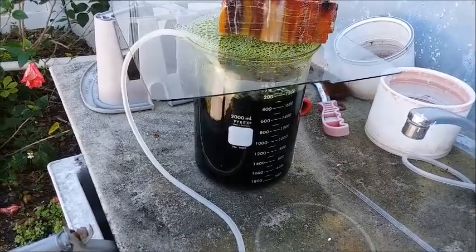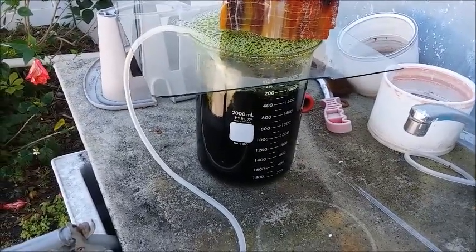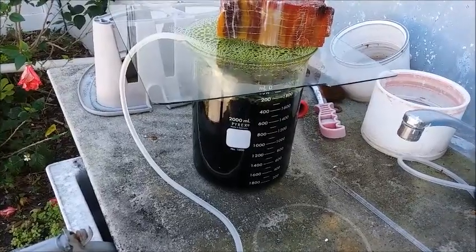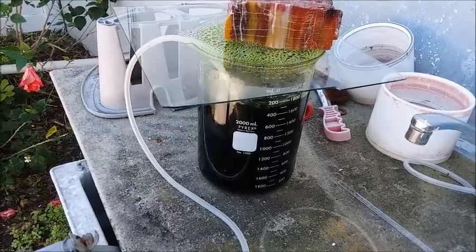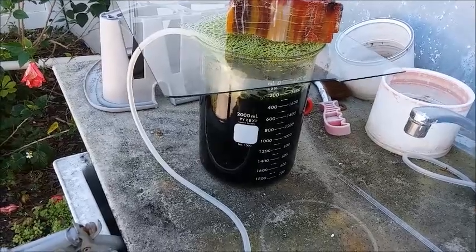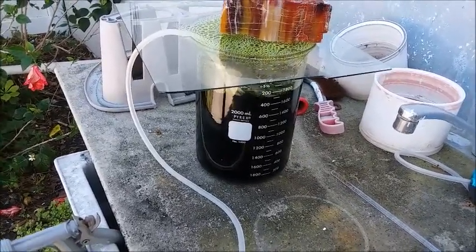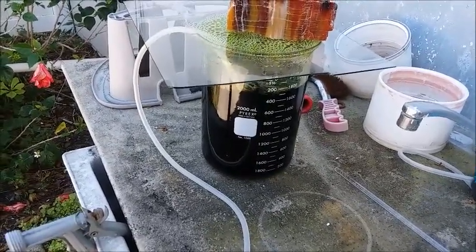Apparently the spent liquid can be used again - the metal salts dissolved in it will attack the next batch I run through. It's also getting really concentrated in various metals: nickel, copper, and so on. I've seen videos about how to precipitate that stuff out of solution, and serious e-waste scrappers don't waste anything - they'll precipitate out those other metals and sell them even if they only get a few cents on the pound. I'll keep it and try it for my own education.